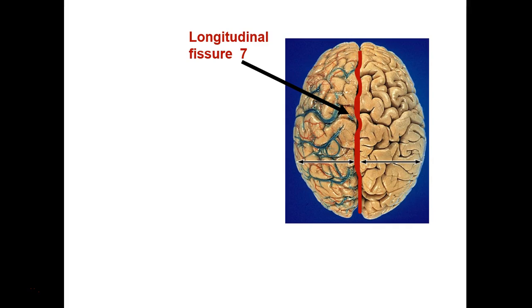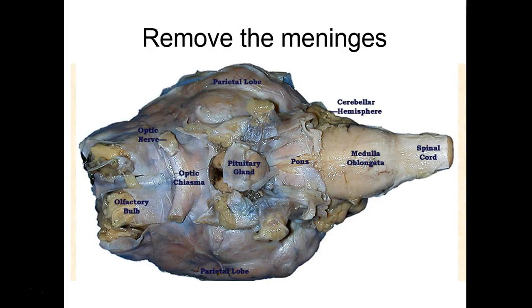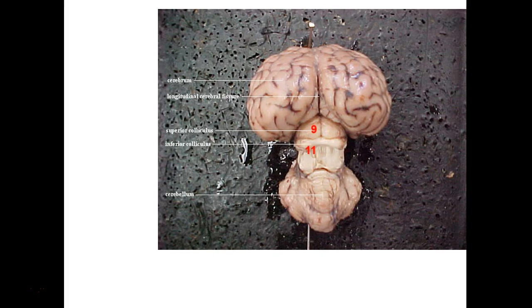So now on your dorsal exterior view chart, you should have, starting from the top with cerebrum, 5, 6, 31, 30, 7, 24, 23, 1, 2, 4, and 3. So in the brain dissection, you will see me actually remove the meninges. So if you were in a traditional lab, you would have to take scissors and very carefully remove that dura mater and a little bit of the arachnoid mater. So if we remove the meninges, then we can see some other structures of the brain.